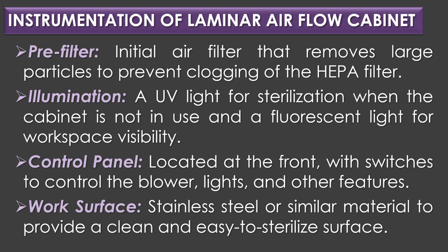A UV light for sterilization when the cabinet is not in use, and a fluorescent light for workspace visibility. Control panel. The control panel is usually located at the front with switches to control the blower, lights and other features. Work surface. Stainless steel or similar material to provide a clean and easy to sterilize surface.